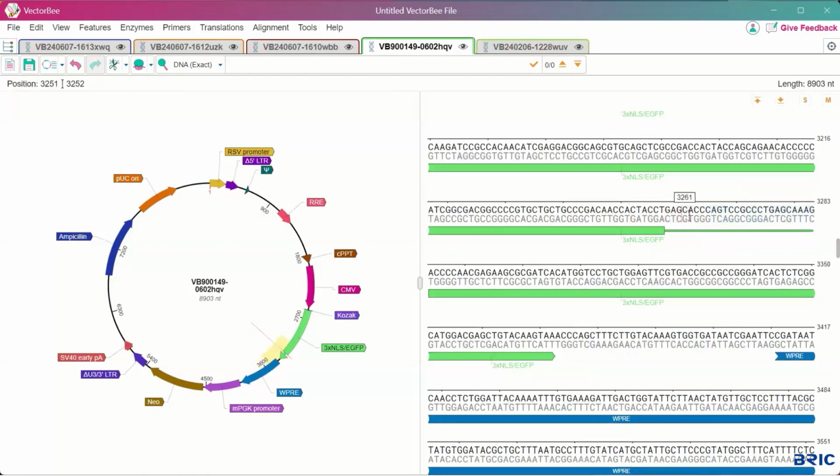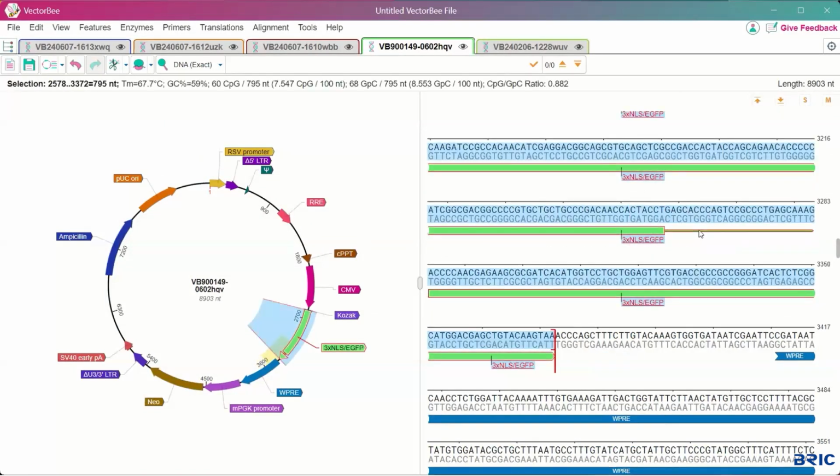This is going to appear as a gap, both on the sequence and on the actual map itself. And importantly, if I decide to copy this feature and paste it into a different project, the feature sequence, the feature title, the gap, any notes, they can all be copied over as well to make sure there is a high level of consistency.